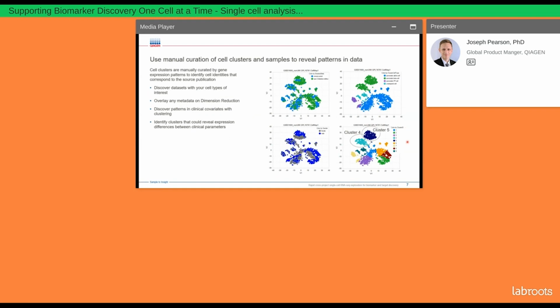You can see here down at the bottom right, one dimension reduction analysis comprised of several samples. And we've curated 9 different clusters colored here. I've highlighted cluster 4 and cluster 5 because as part of our curation process, our biologists identified that both of these clusters belong to pancreatic beta cells, curated here and labeled up at the top right.